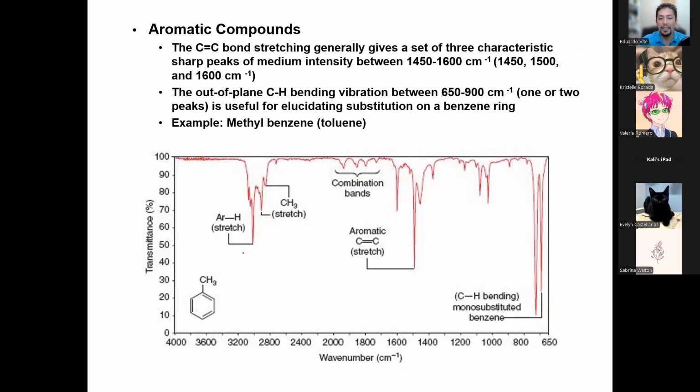Well, you see the stalactites are still present roughly at the same location, between 2800 and 3000. But you'll notice their shape is a little different. They are less intense. They are weaker. Why are they weaker? Because double bonds are stronger, so you need more energy to vibrate them. So it might absorb some energy, but not as much as a single bond. That's why the intensity is lower.